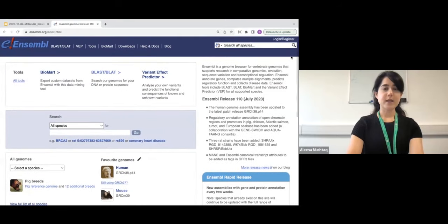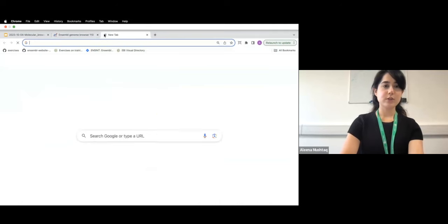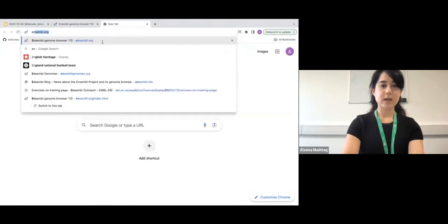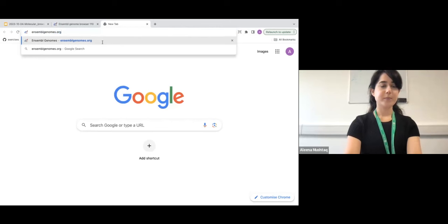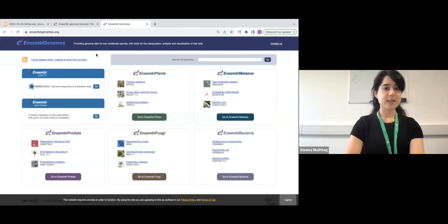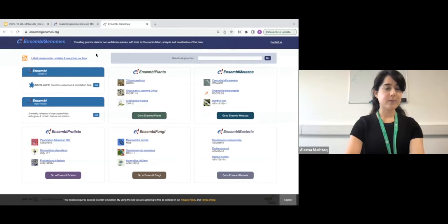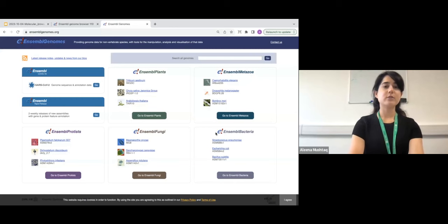I'm going to quickly show you Ensembl Genomes. Opening a new tab and going to ensemblgenomes.org takes me to the Ensembl Genomes website, which is divided by taxa. You can find Ensembl Plants, Ensembl Metazoa, Protists, Fungi, and Bacteria here. This website is dedicated to non-vertebrates.